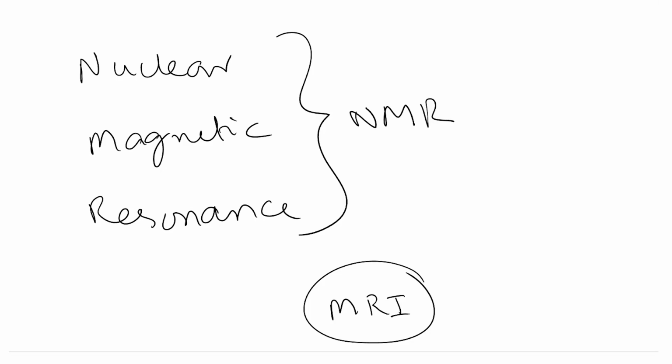So, what we will be discussing in this module today, you will learn how to interpret spectra. You will understand the basics, and you will also realize that a lot of things about the proton and the carbon-13 NMR can actually be learned, the information that you can get is quite huge. So, before we start, let us go to a little bit of basics.